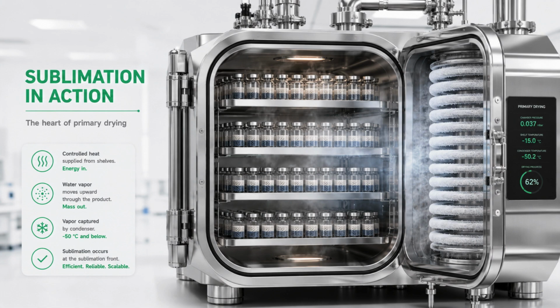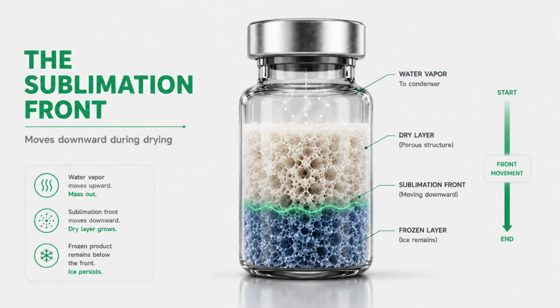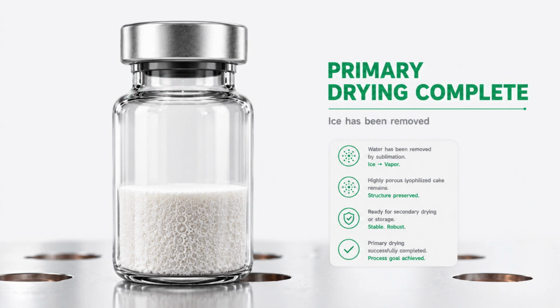Sublimation is the scientific foundation of primary drying. By combining controlled heat, deep vacuum, and continuous vapor removal, frozen water is removed directly as vapor, while preserving the product's structure. Understanding this process is the first step toward understanding how pharmaceutical lyophilization achieves stable, high-quality products.